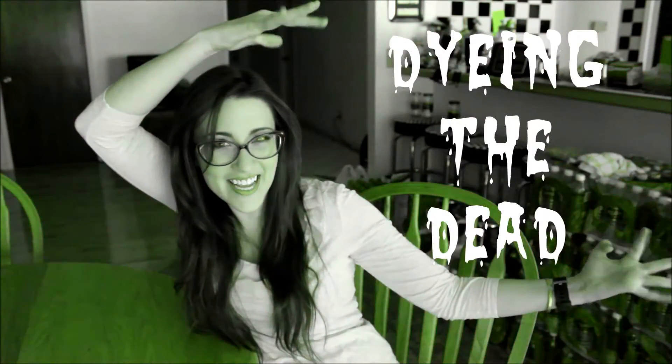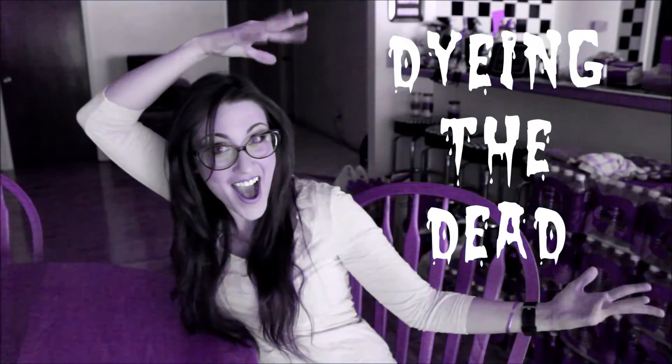Hey everyone, it's Telly, and welcome back to another episode of Dyeing the Dead. In this video, we're going to be rehydrating our specimens.